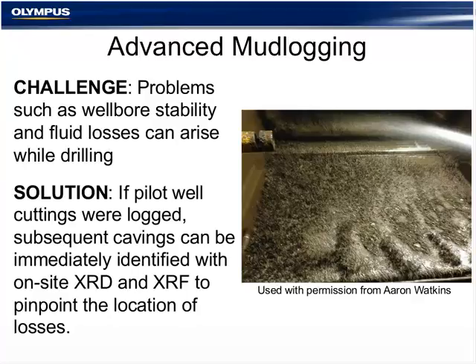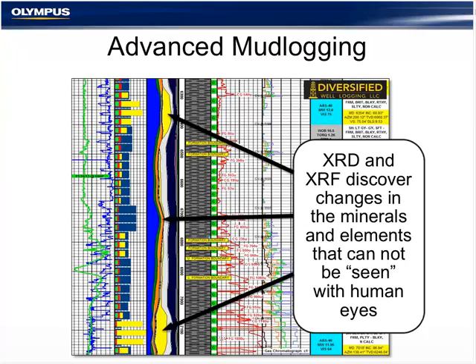What we are looking at here is a typical log that incorporates mud logging and engineering, drilling, and MWD gamma data sets. But what's extra on here, you see the arrows pointing to, is a track with XRD information. You can see some arrows pointing to the shale, which was the visual lithology, and I saw these cuttings for myself. That's exactly what they look like. Even under a microscope, they were very, very homogeneous. But once we were able to run the field XRD on them, now we can see vivid differences in those visually homogeneous shales.